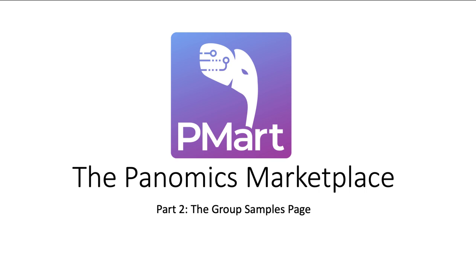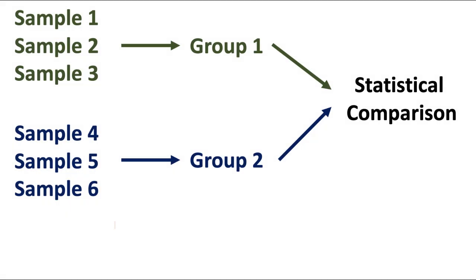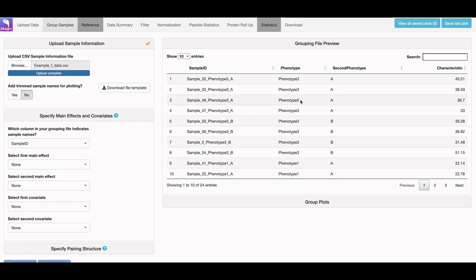In this video, we will cover how to specify group information for your samples. Group information is necessary to conduct downstream statistical comparisons. Building off of our example from the last video, here we see the samples for the peptide measurements, referred to as the sample ID column, with additional information regarding the primary and secondary phenotype that each sample belongs to.